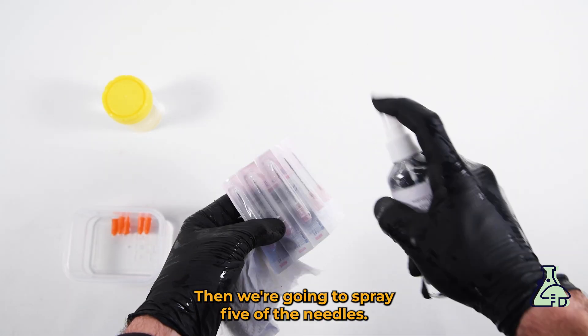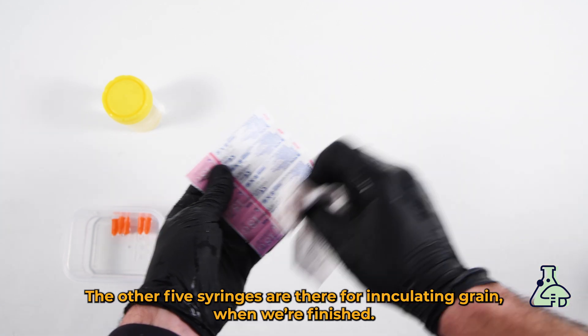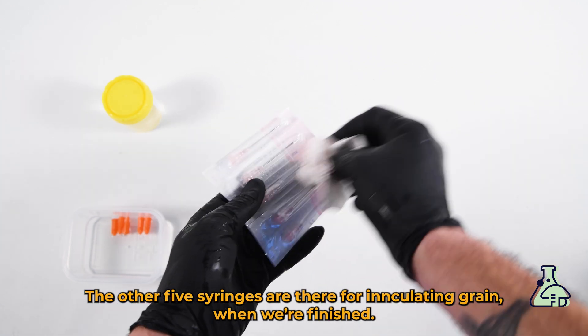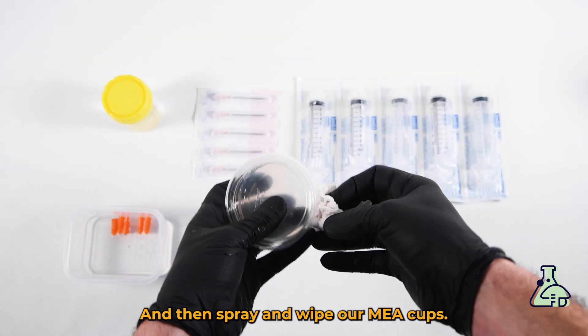Then we're going to spray five of the needles and give them a wipe. The other five needles are for inoculating grain when we're finished. Give the sterilized syringes a spray and a wipe, and then spray and wipe our MEA cups.